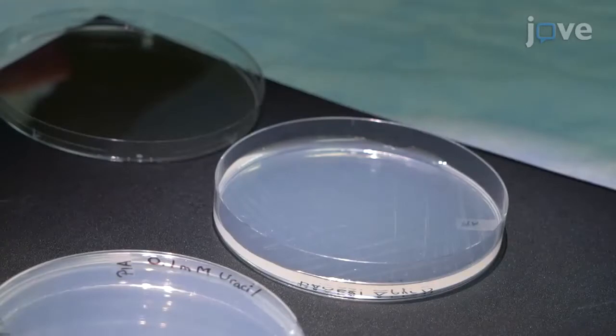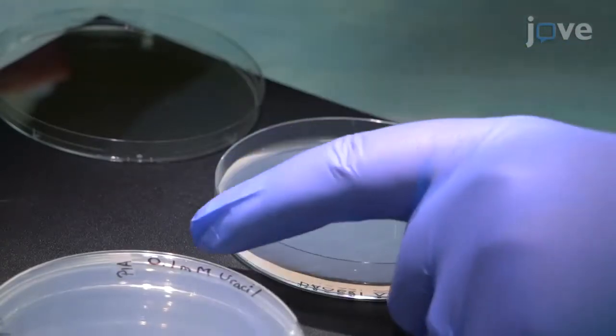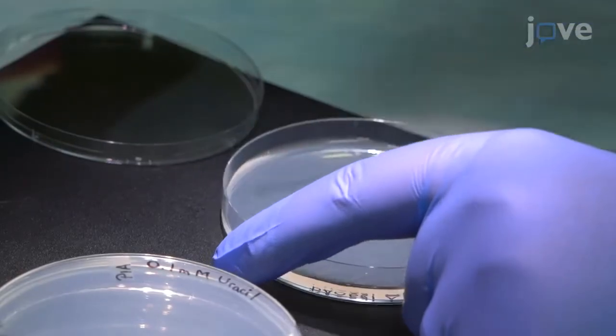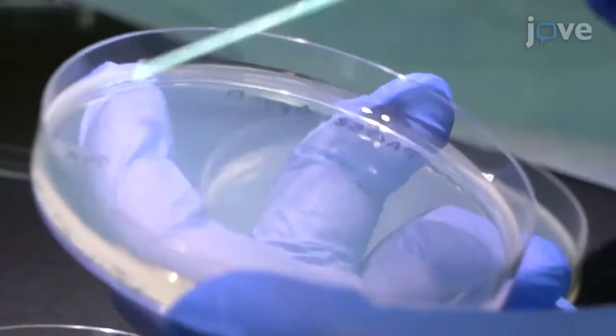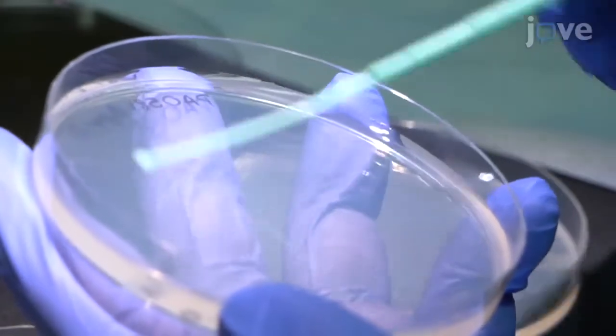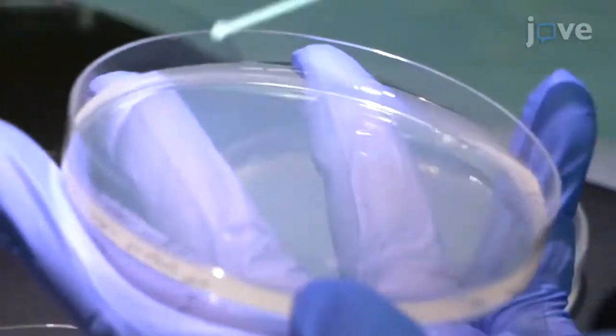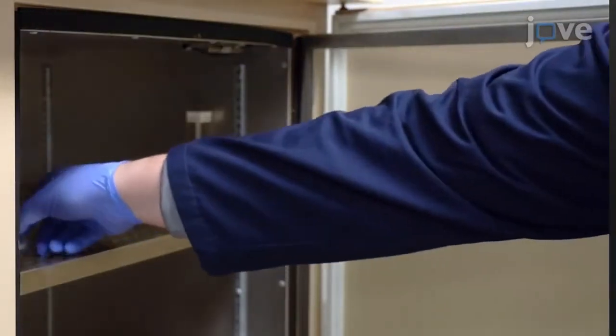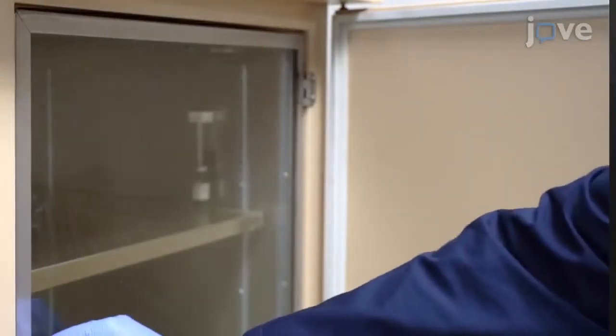To perform physiological activation of the salvage pathway, use a sterile inoculation loop to pick the SCV colony from the PIA plate. Streak the selected colony on a pre-warmed PIA plate supplemented with 0.1 mM uracil. Grow the plate at 37 degrees Celsius for 24 to 48 hours.